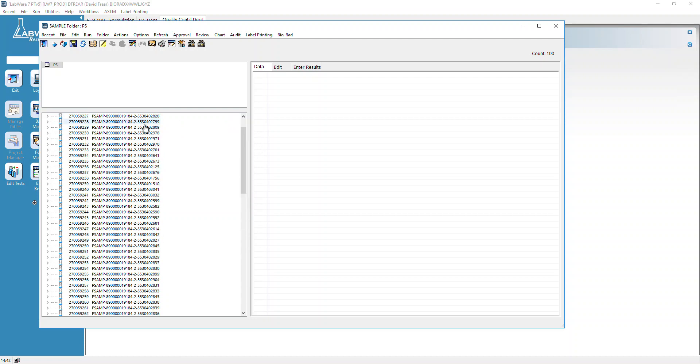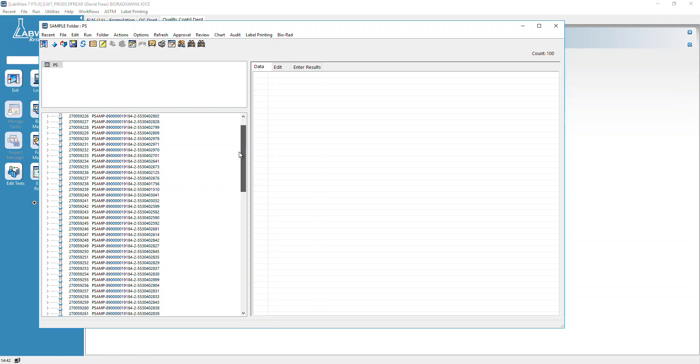If, for example, one of those came up as a duplicate, it's kind of nice to know where it is in the sequence, but you'll have to search this last number here and find your P record. It should give you the sample number and the P record.